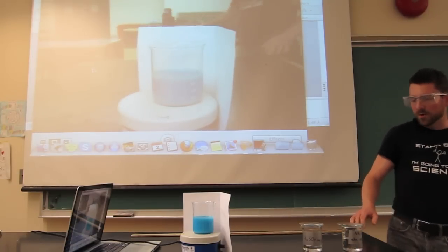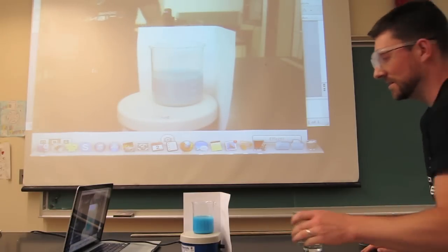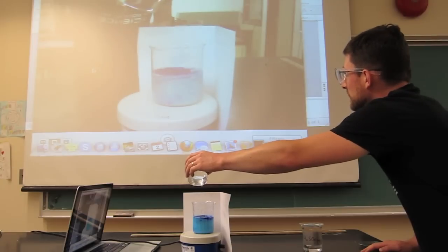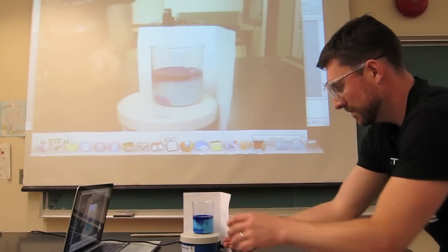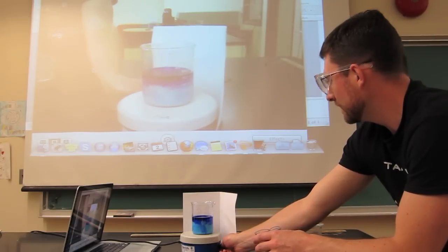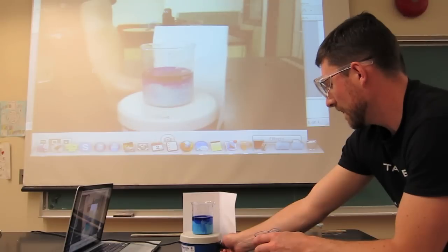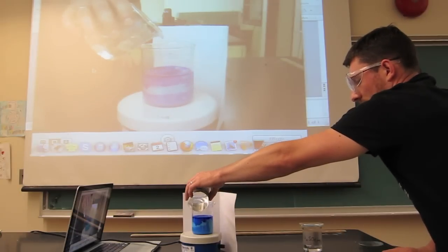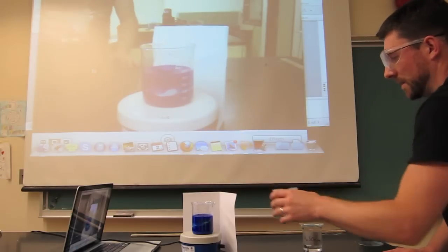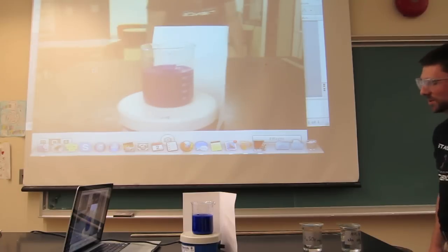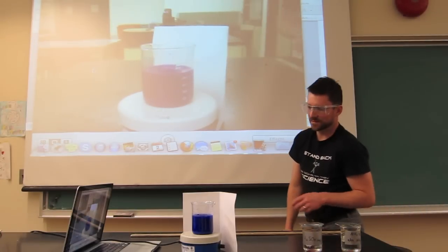By adding more ammonia, we are actually going to see this precipitate change into a dark blue solution. You can see the dark blue is forming. And on top of the dark blue forming, the precipitate is actually going to disappear. And there it goes. So, we have actually seen the clear blue copper II ion precipitate to form a light blue solid, and then the light blue solid yields this dark blue solution.